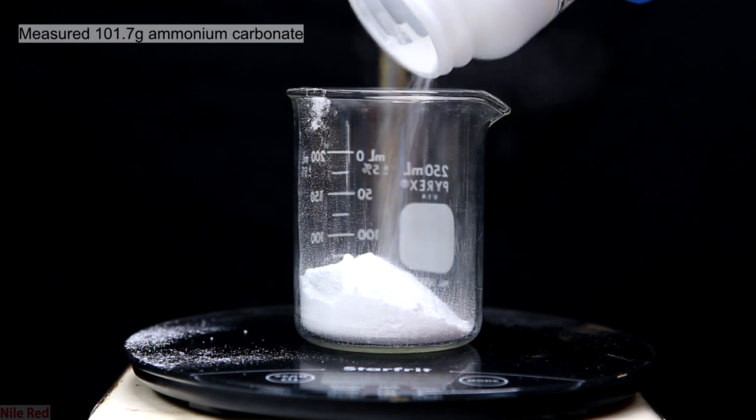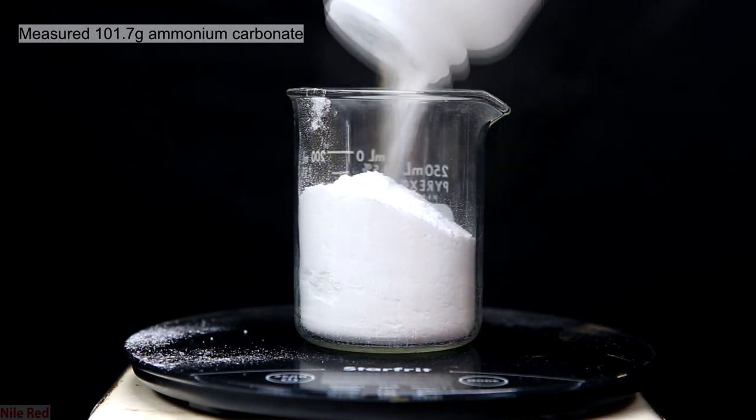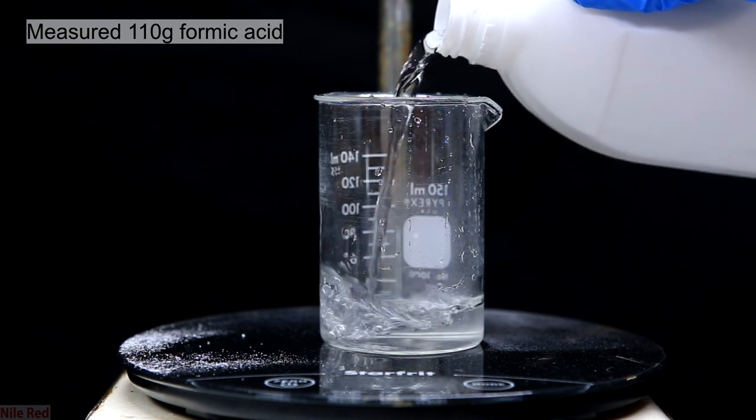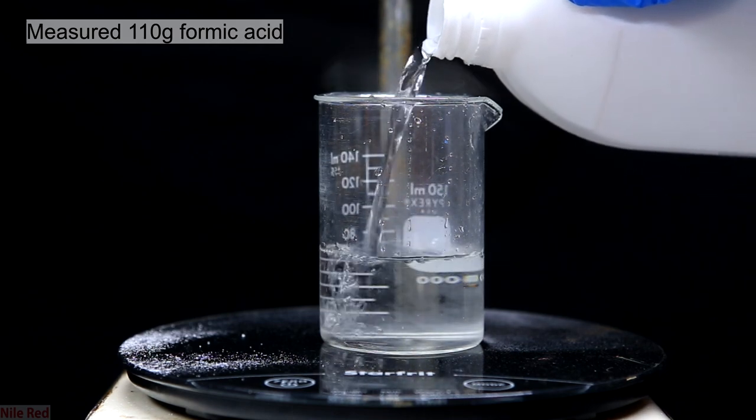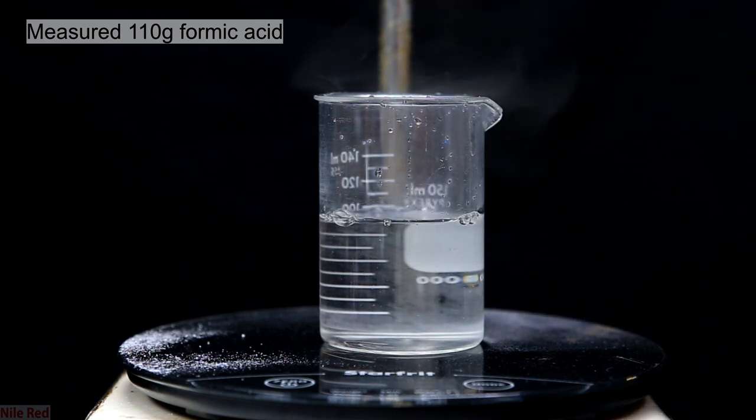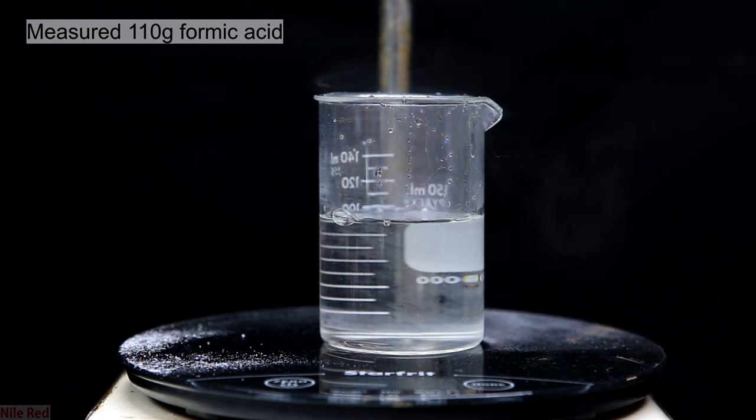I start out by weighing 101.7 grams of ammonium carbonate. I then moved on to the formic acid and I weighed out 110 grams. The formic acid that I used was 90 to 92%, so I made my calculations based on the assumption that it was 90%.